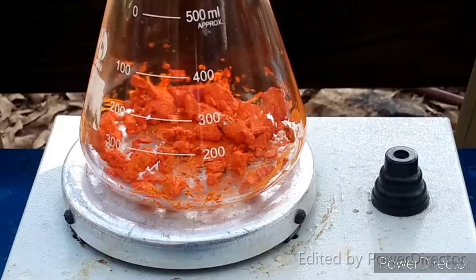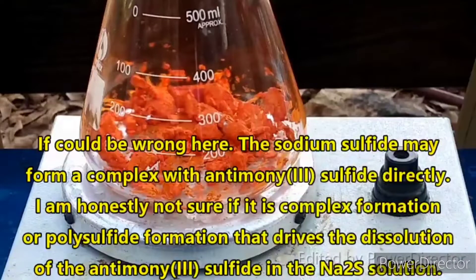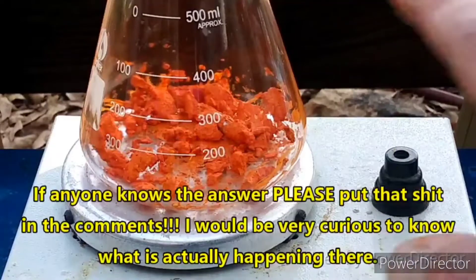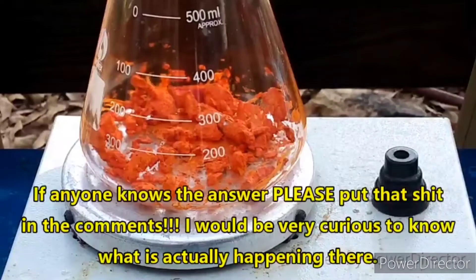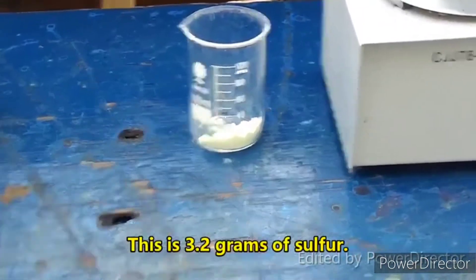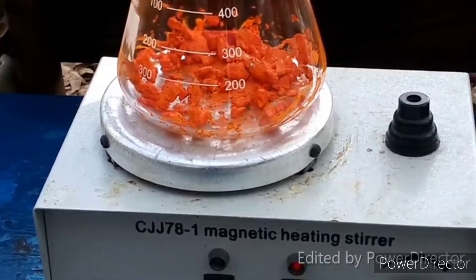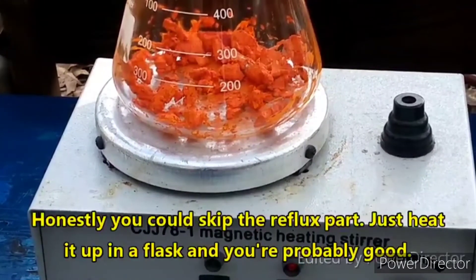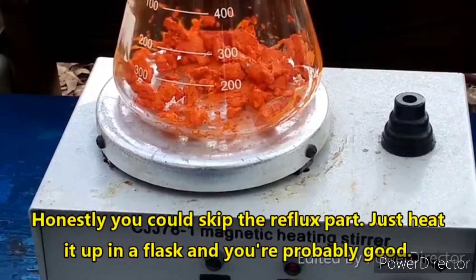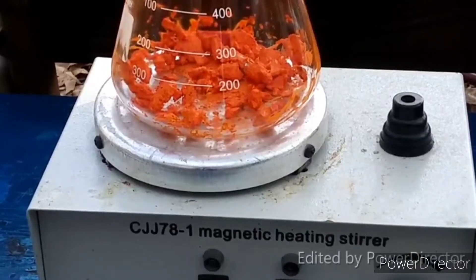The way this is supposed to go, from what I understand, is that our sodium sulfide solution will react with the antimony trisulfide — the sulfide will react with the sulfide to form polysulfides — and that will cause all of this to be soluble. Once it all dissolves, we are then going to take some powdered sulfur, add that in, and then reflux this until all of the sulfur dissolves, at which point we crystallize it and recrystallize it, and voila — we will have pure sodium thioantimonate.